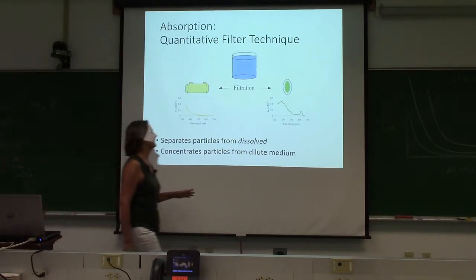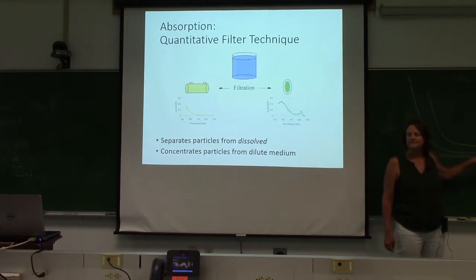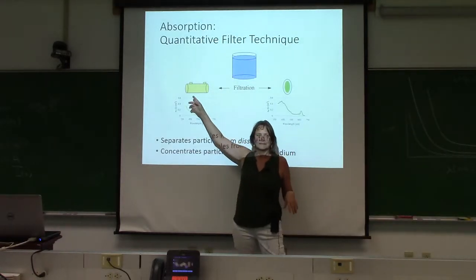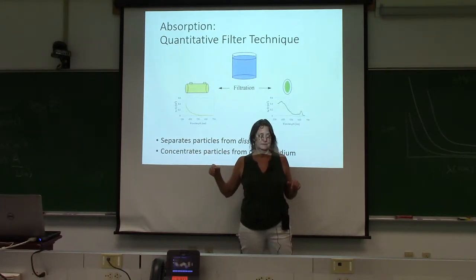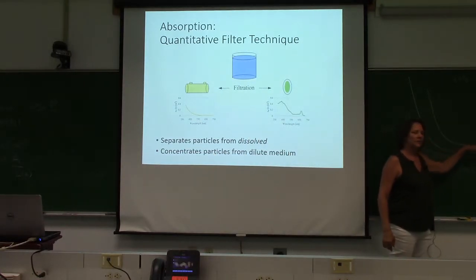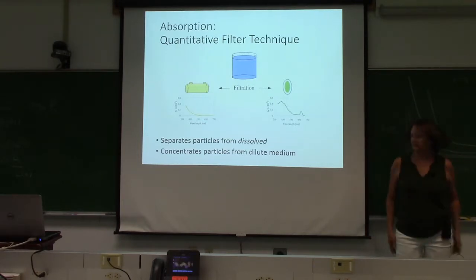And what I'd like you to think about also is, if this is scattering, what size particles are in your cuvette? Tiny. Okay, tiny particles. And tomorrow we'll talk about scattering, and about the spectral dependence of scattering as a function of particle size. So we're not going to answer this now, but think about what spectrum of scattering you might want to remove. Is it flat? Is there some dependence? So keep this in mind.